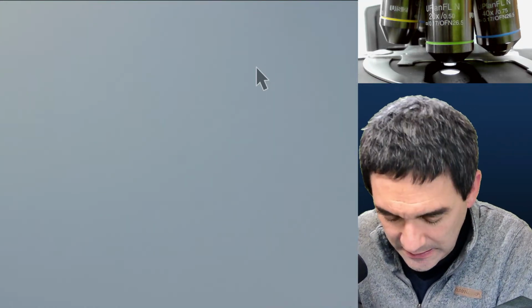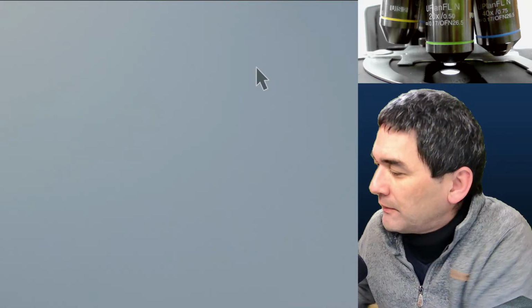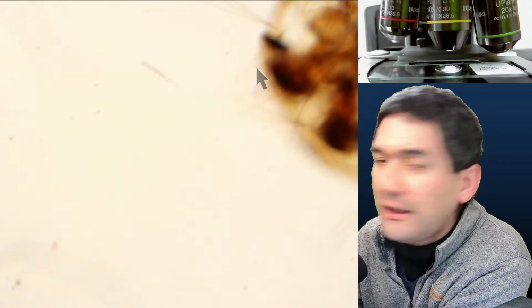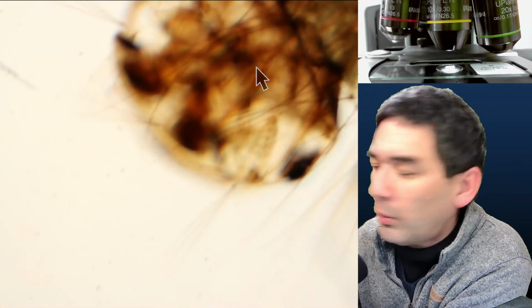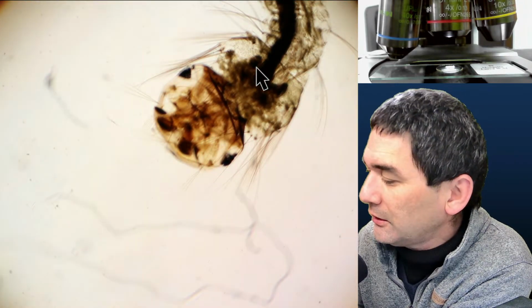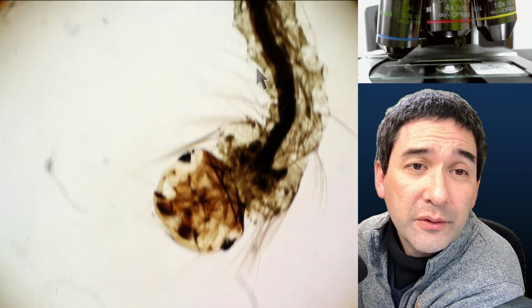86, 87, 88, 85, mosquito larva. Okay, that is now a larva, and this one is something that some of you might have already also found in water. I think they look quite nice when you are still alive because they're moving around.